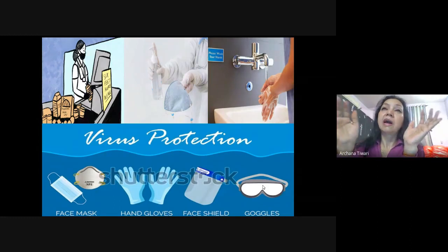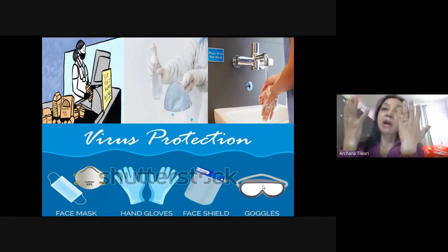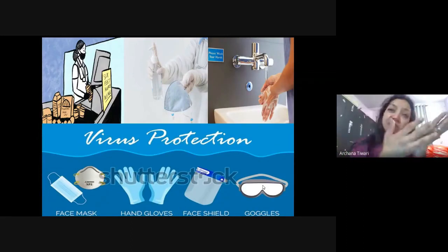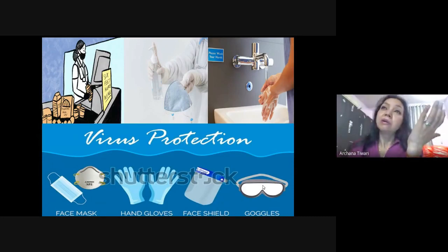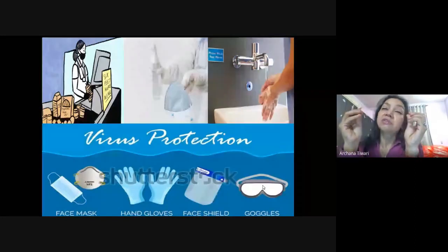Kindly mind it. If you want to sterilize your hands, cover them with gloves, as we do in our labs. In the same manner, wear the gloves and sanitize them with sanitizer, not directly on your skin.